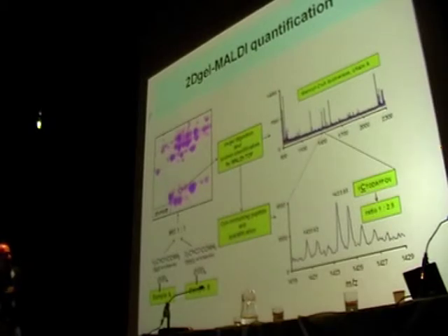And all we do in vitro is modify proteins in one sample with a light compound, and in the second sample with a heavy compound. In this case, we use acrylamide. It's a very simple compound. People used to use it to run acrylamide gels, but it has a double bond. And you see, commercially available heavy acrylamide has 3 deuteriums shown in blue versus 3 protons. The only difference is basically that it's 3 units heavier. That's all we need from mass spec.